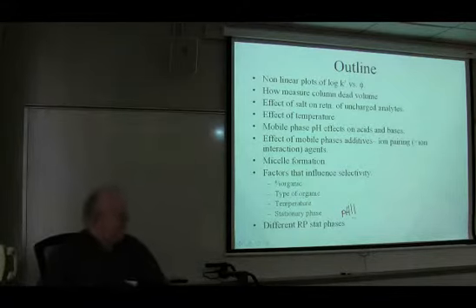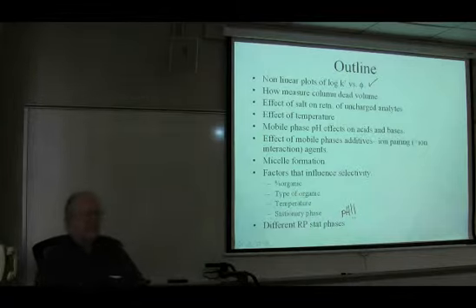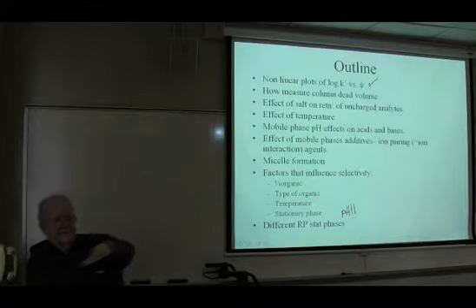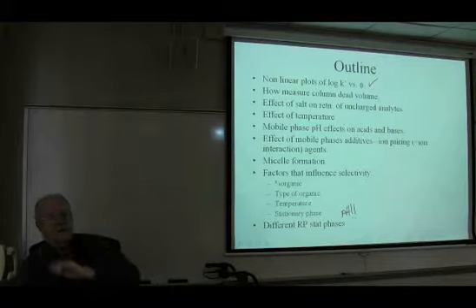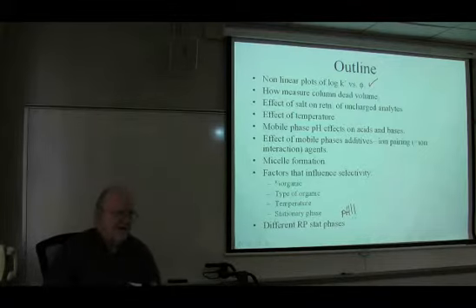Okay, so let me start the stuff for today right here. In fact, sometimes a plot of log k prime versus the volume fraction phi is nonlinear. It'll come down roughly as a straight line, and then it'll curve over, go through a minimum, and sometimes it'll even come back up. That is not uncommon, but it's not common.